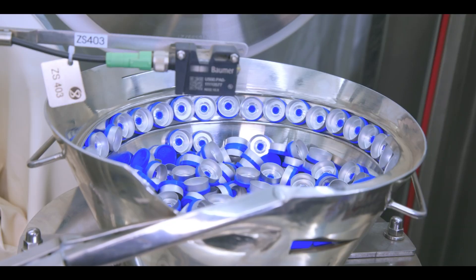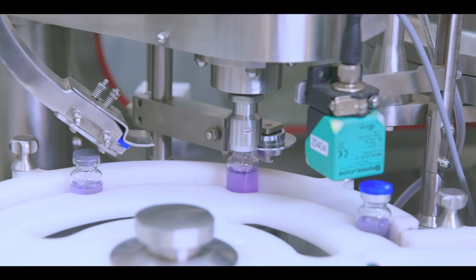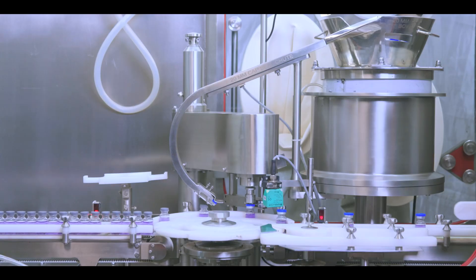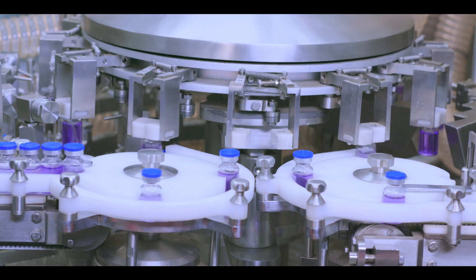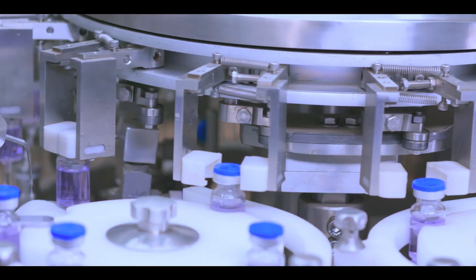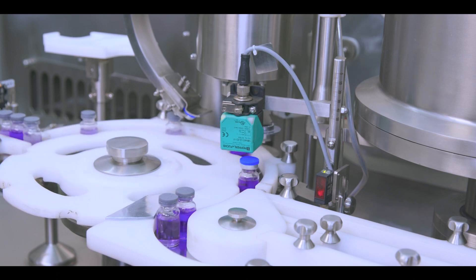The vial cap sealing machine seals the vials with pre-sterilized caps. Caps are fed into the isolator through a rapid transfer port. Its indexing mechanism and crimping action ensures the complete sealing of vials. The rejection system removes the uncapped vials from the line.